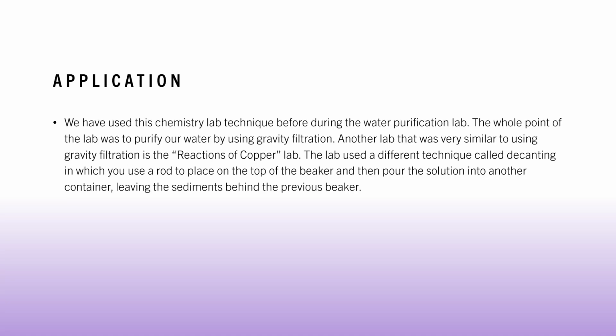So application, we have used this chemistry lab technique before during the water purification lab. The whole point of the lab was to purify water by using gravity filtration, and for us to be familiar with how to purify solutions or water with solids/sediments. Another lab that was very similar to using gravity filtration is the reactions of copper lab, which showed a different technique called decanting, in which you use a rod to place on the top of the beaker and then pour the solution into another container, leaving the sediments behind with the previous beaker that's currently in your hand.